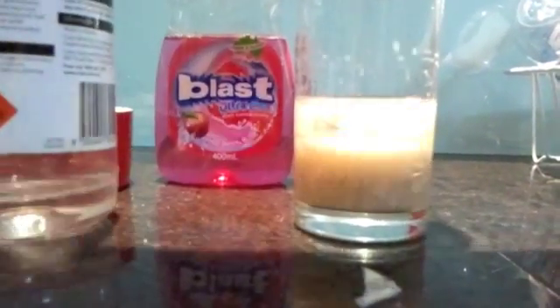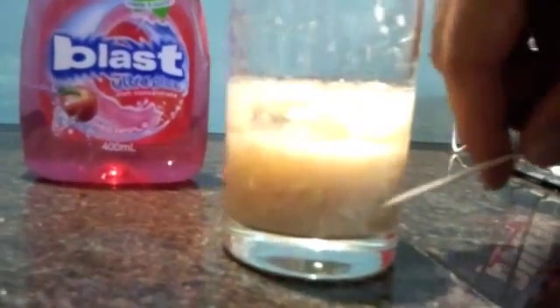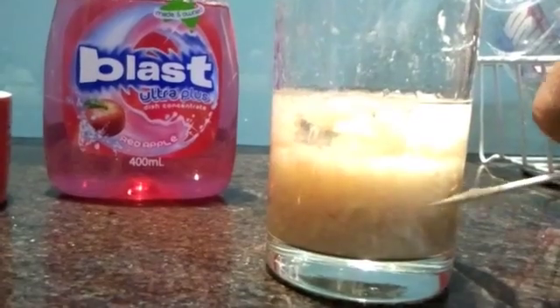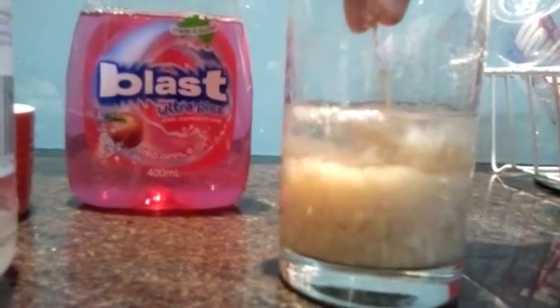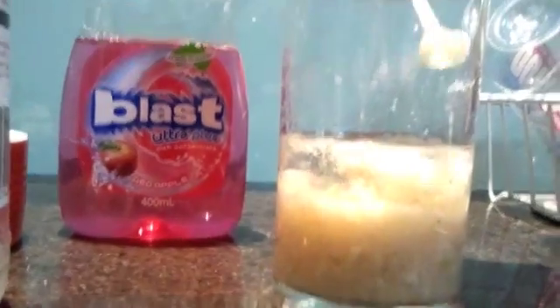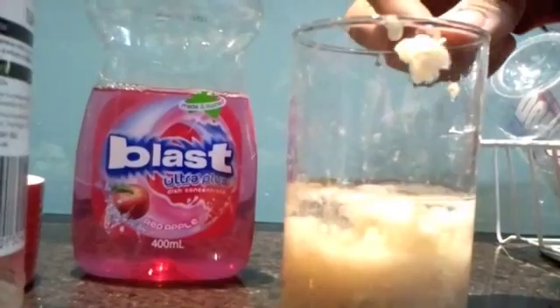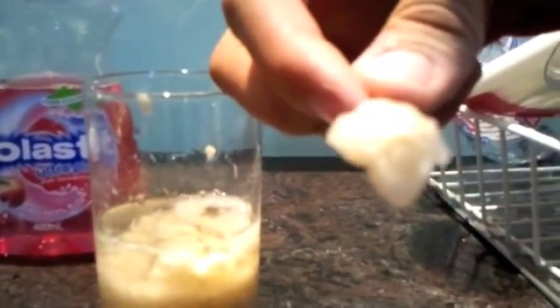Methylated spirits is used because the DNA is soluble in water, but it's not soluble in the methylated spirits. So when we pour that in there, it pulls the DNA out of the actual solution, and then when we leave it for a while, you get this gunk on top, and that is the actual DNA. It doesn't look like much right now, but if you looked at that with a microscope, it would look pretty amazing.